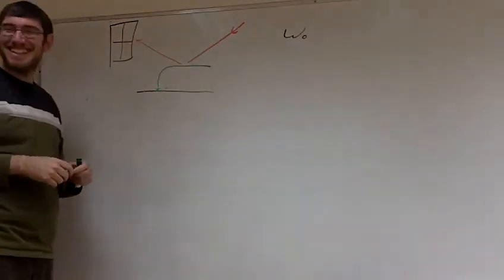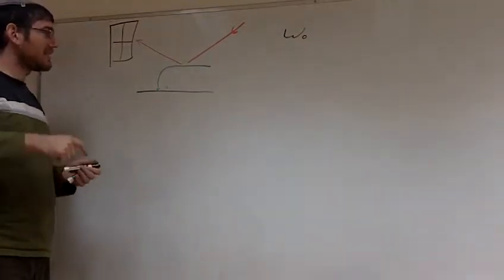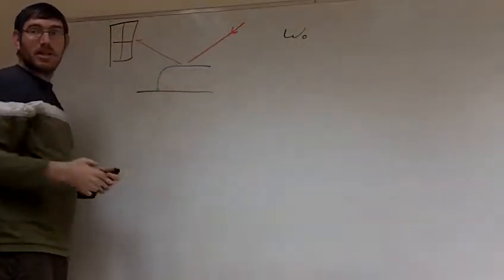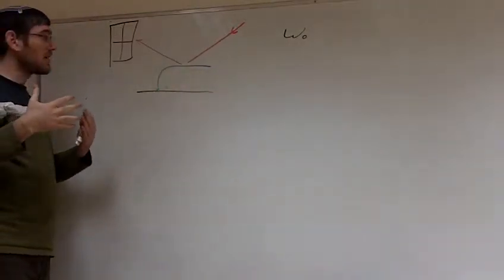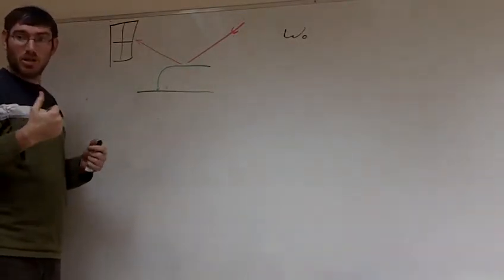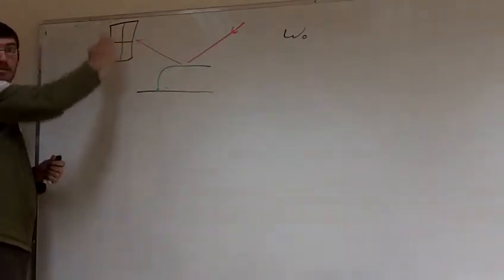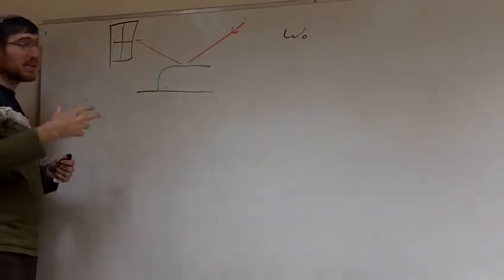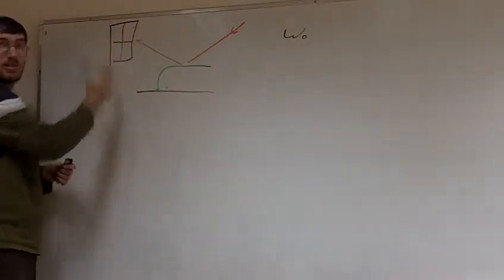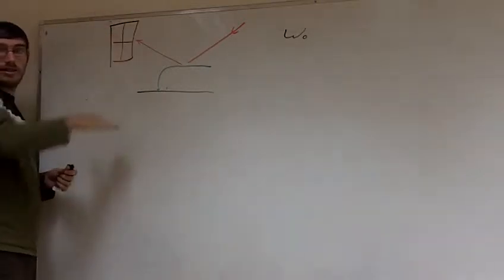So is this in Z direction or XY direction oscillations? Okay, very good. The oscillation is in the Z direction. That means it's going up and down in this direction. When we oscillate it, we also have oscillations in different directions, but what we're going to monitor here is oscillation up and down. That's what we're going to look for. It's also possible to look at deflections in the horizontal direction, but in the simple mode, we're going to concentrate on the vertical direction.